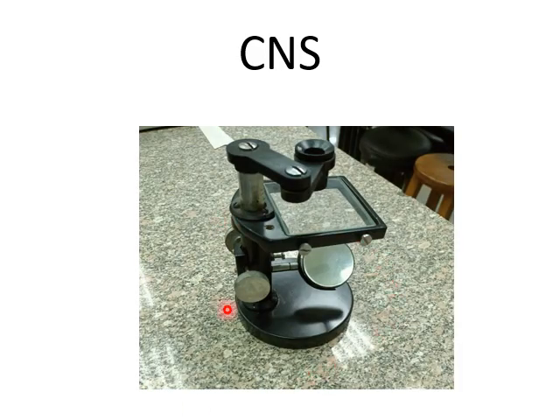Dear students, the microscopic slides for the CNS, you're going to inspect through this microscope. It's very easy. You're going to put the slide here, and this is as if it's a magnifying lens. Okay?